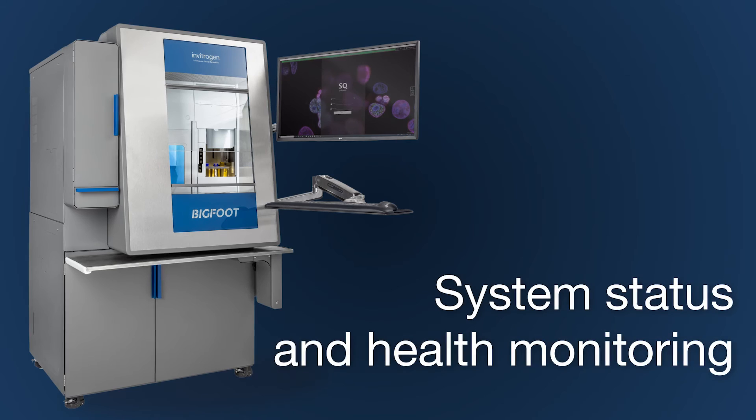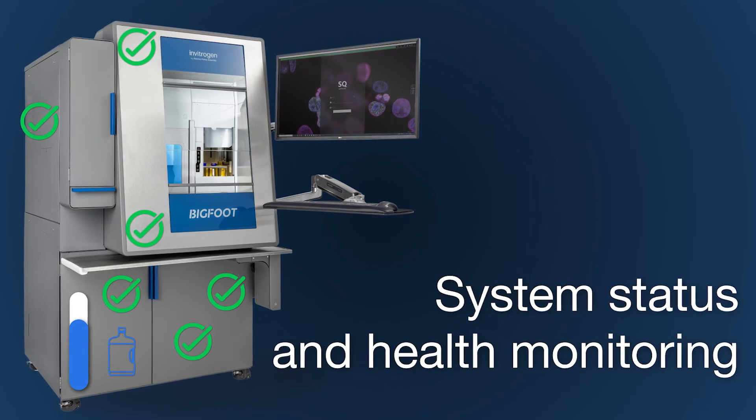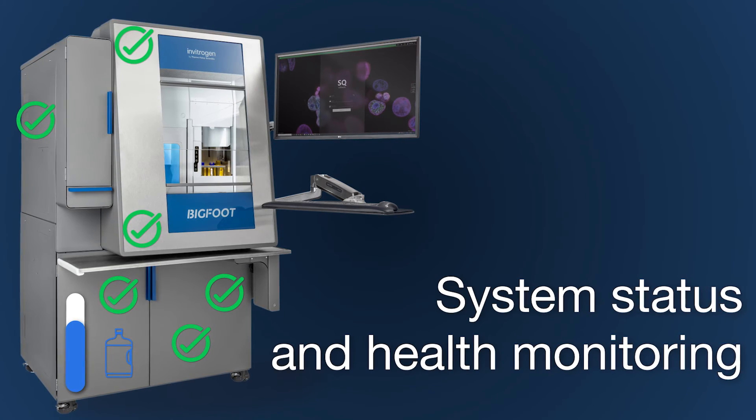System health monitoring provides status and control, giving you the freedom to walk away from the system while still monitoring experiments and to start up or shut down remotely.